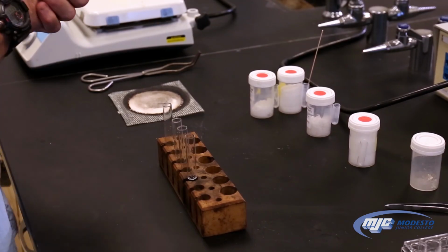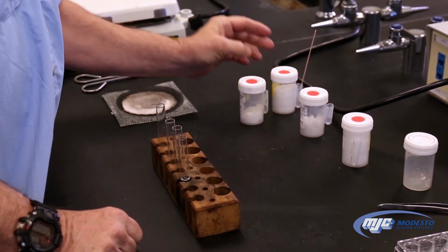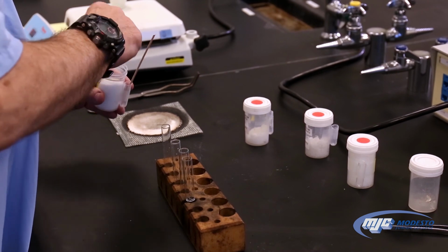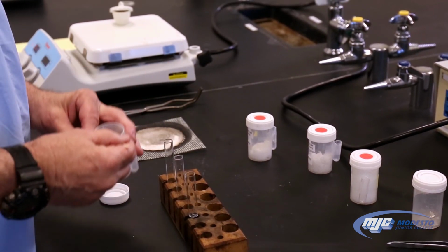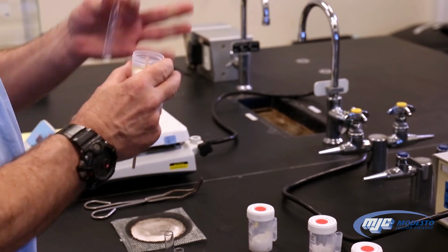So, lucky enough to be able to do the magnesium strip test, what we're going to do is take a little bit of our unknown, take a small test tube. Now we don't need that much. Just a little bit is fine. It's probably even hard to see. Just a little bit on there, and that's actually more than enough right there.